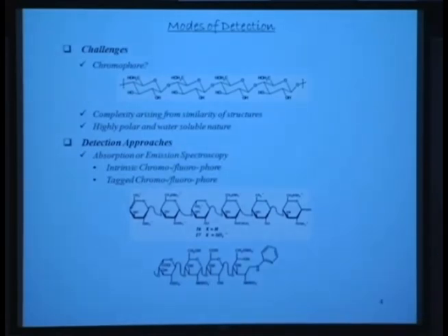So you basically use the reducing terminus, in essence, for most part. Okay, now, I'll just ask the question. I did mention that you can use this technology. What is the problem with this detection system for isolation purposes?